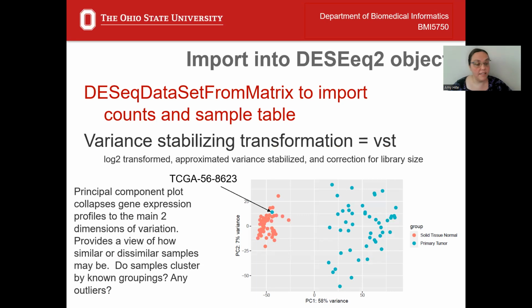So when you're doing this analysis, you need to make a decision. Do you leave the data as it is, just knowing that this one tumor is over here and it might affect our results a little bit? Or do we take this tumor out? In this example, where it's split so well and this tumor is really embedded into the normal cluster, I would just remove it. Since we have a big enough sample size, removing one sample is not going to impact this analysis very much. So in this case, I would remove the sample.